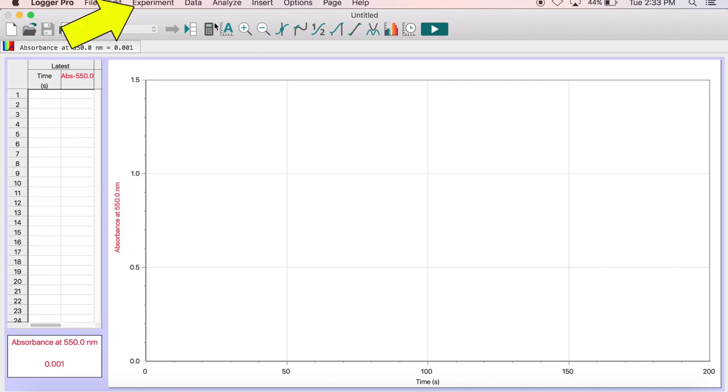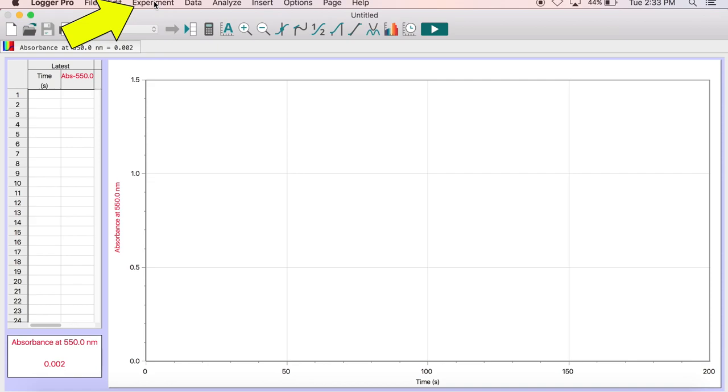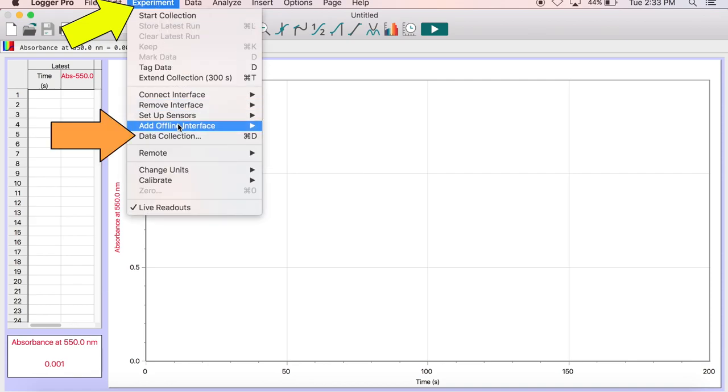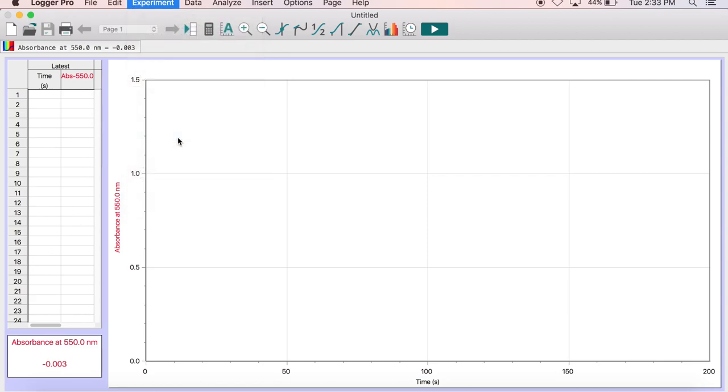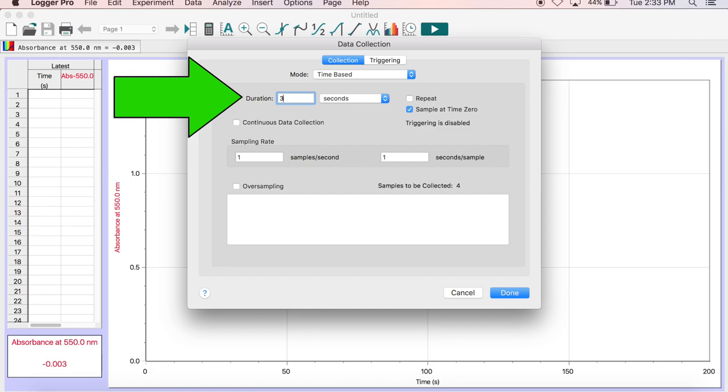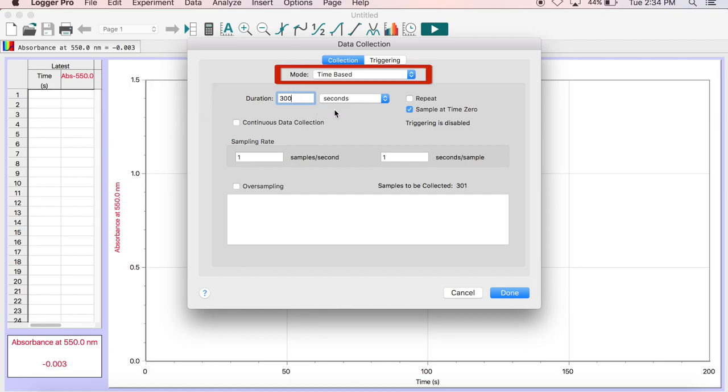To change the duration of time the spectrometer will be collecting data, click on the Experiment tab at the top of the screen to bring up a drop-down menu. Select Data Collection from this menu and click on the Duration box. The units should be set to seconds and 200 will be the default. Go ahead and change the duration to 300 seconds. The mode should also be time-based and the box Sample at Time Zero should be selected. Click Done or OK when finished.